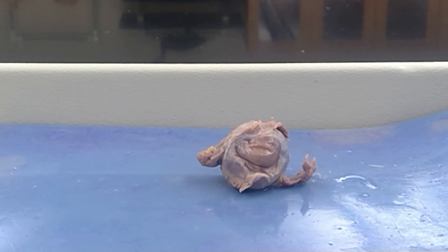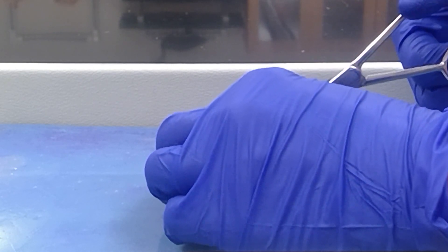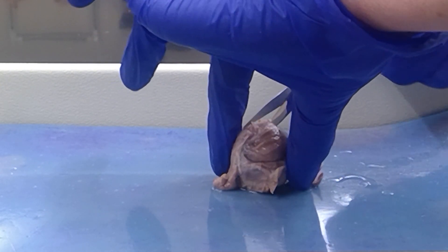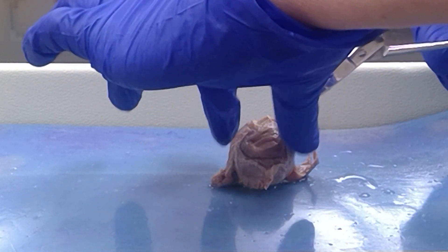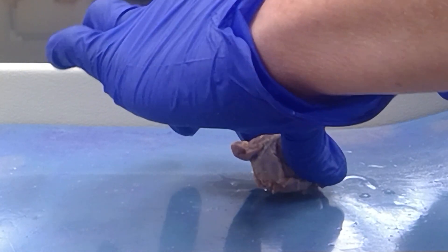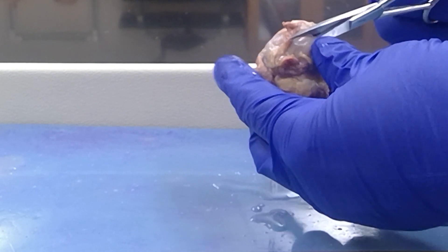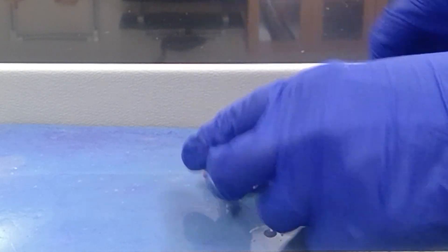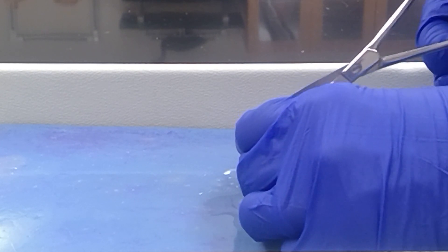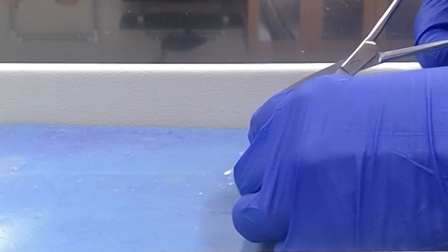Now I'm going to cut into the sheep eye and open it up. Bear with me for a while. All I'm doing is cutting a circle to separate the anterior eye from the posterior eye. I'm just separating the anterior portion of the eye from the posterior. Here I'm going to flip the anterior portion down, cutting through the sclera, some orbital fat, and those extrinsic eye muscles that I just talked about.